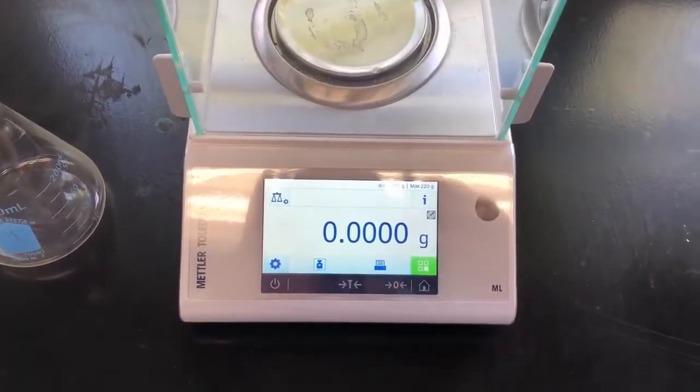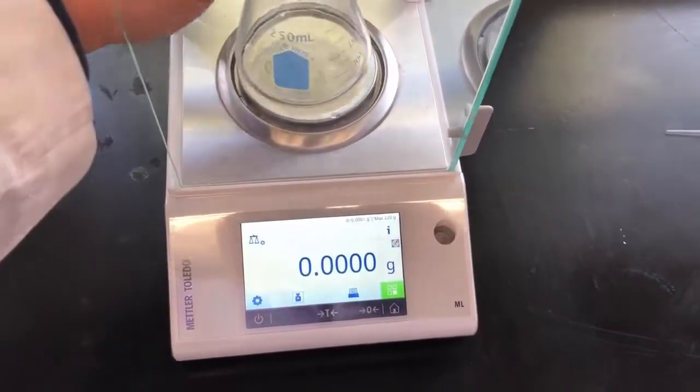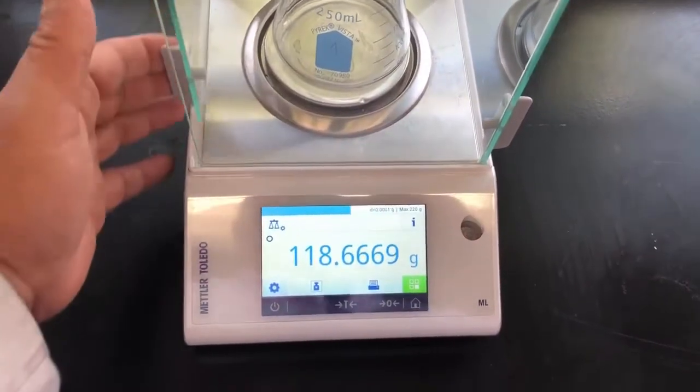So now let's go ahead and record the mass of the flask. I've tared out the balance, so let me go ahead and put the flask in, and we can collect our mass of the flask and aluminum foil together.